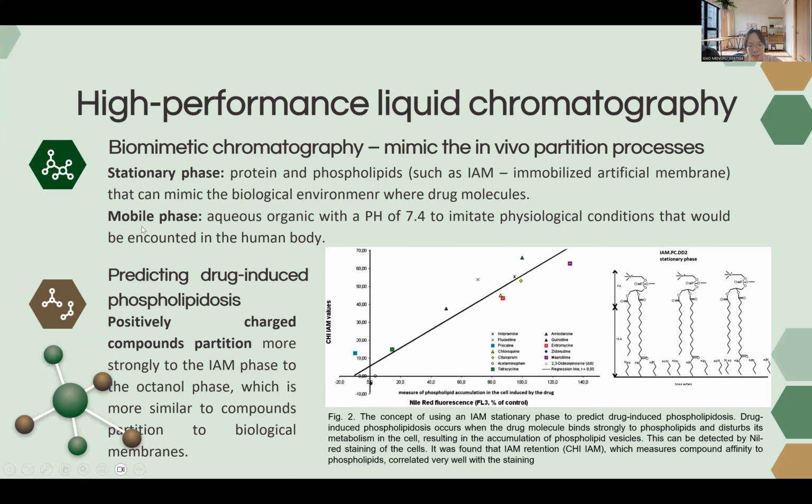Firstly, I will present the application of high-performance liquid chromatography in the biological field. The stationary phase contains proteins and phospholipids, such as IAM. This is an immobilized artificial membrane that can mimic the biological environment where drug molecules distribute.